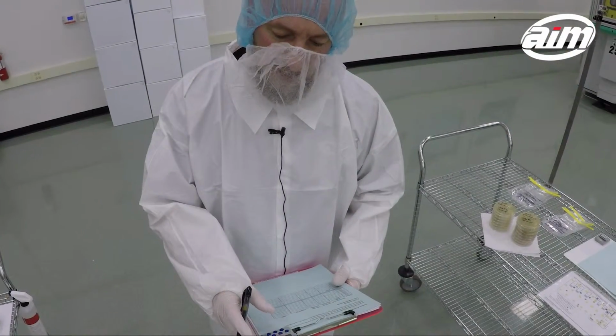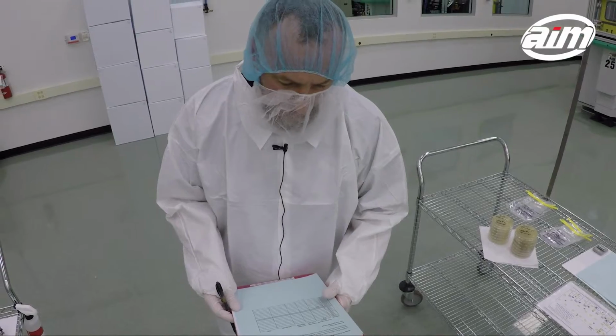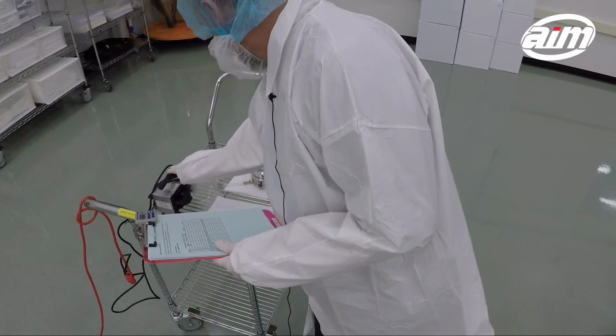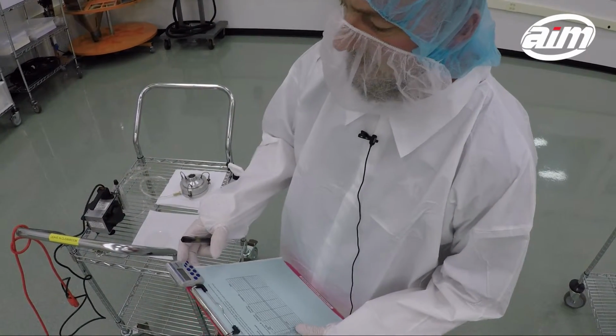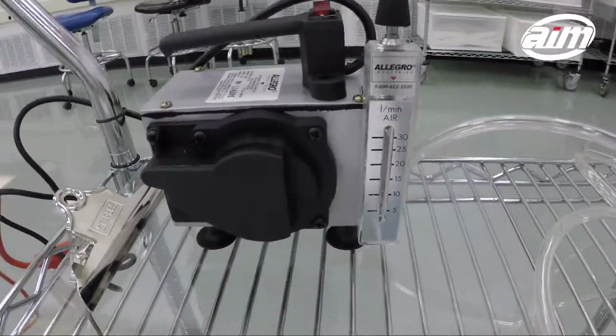I set a calibrated timer. And basically, once I start the pump, start the timer, and we start our 10-minute sample collection time.